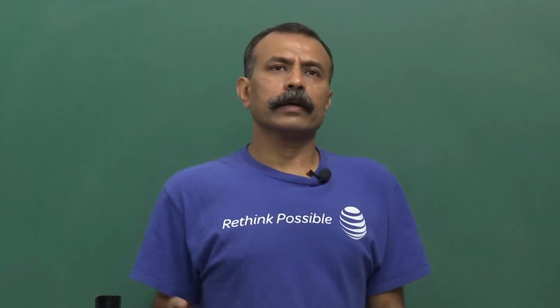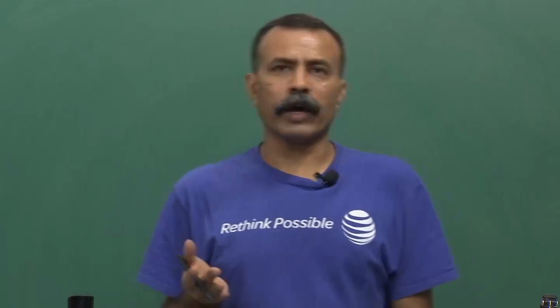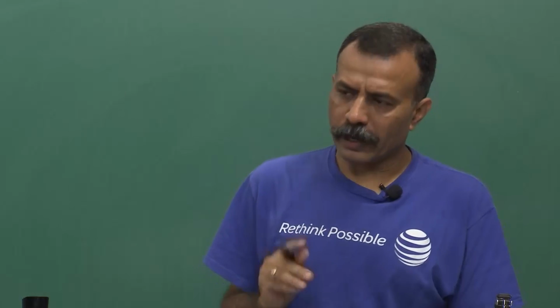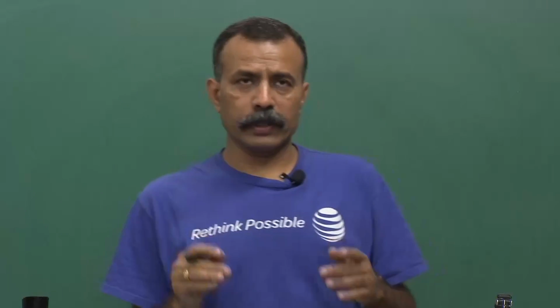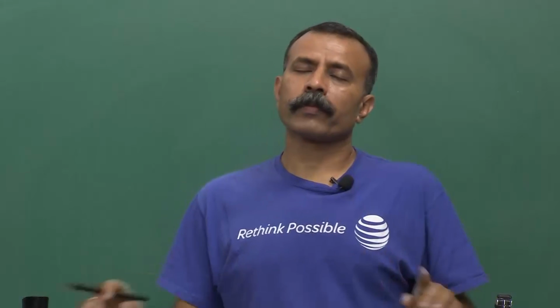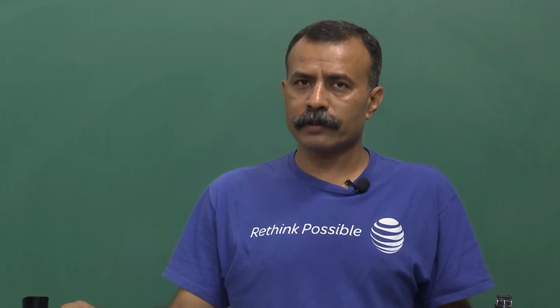After that, the way I used to do it, I will share my experience, but I will leave it up to you. I used to switch on the UV and leave it on for 10 to 15 minutes, followed by that I get in. First thing you should do, when the UV is on, put on the goggles, otherwise it damages your eyes.